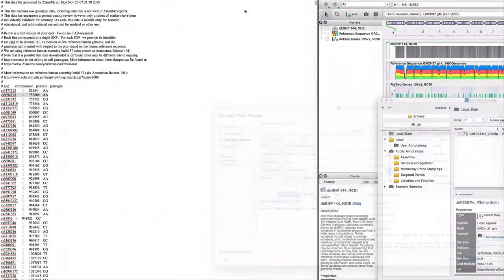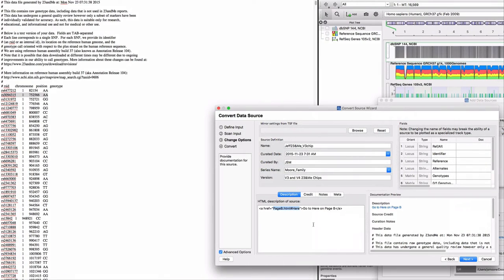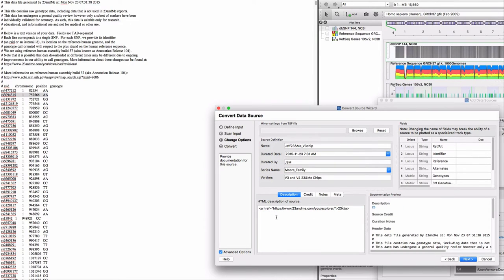I'll copy and paste the URL to the raw data page from my 23andMe account. Now when I'm viewing my data in Genome Browse, this link will always be immediately available.